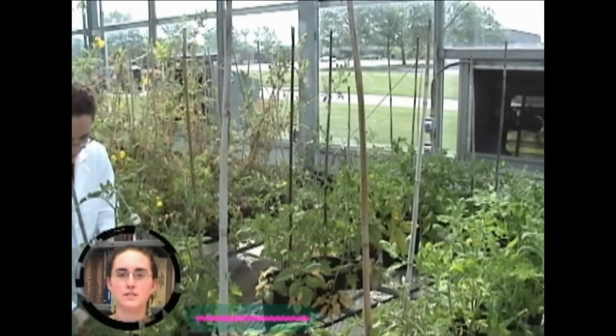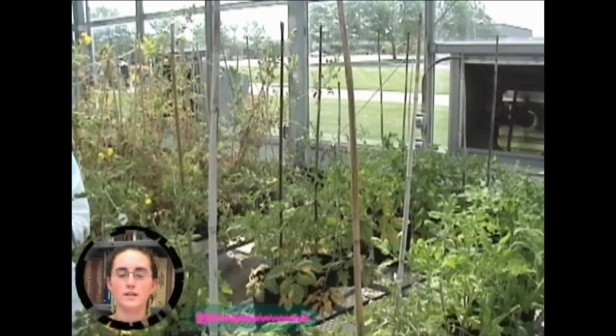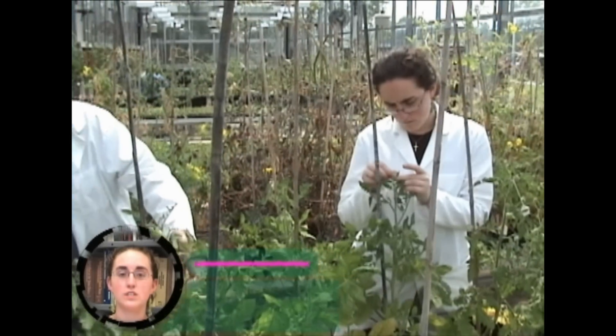I'm Sarah, one of the undergraduate researchers working on the Solanaceae Coordinated Agricultural Project, or SOLCAP. Today we're going to be looking at making crosses between different tomato genotypes.